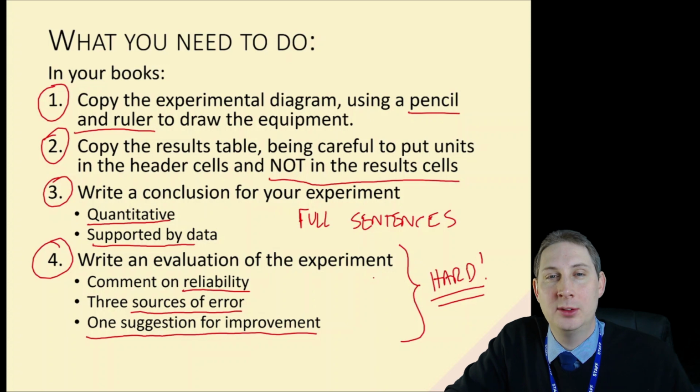And that is it. Once you've done those, that's the end of the Limestone practical, and we now just need to wrap up the project and the entire topic ready for your end of topic test.